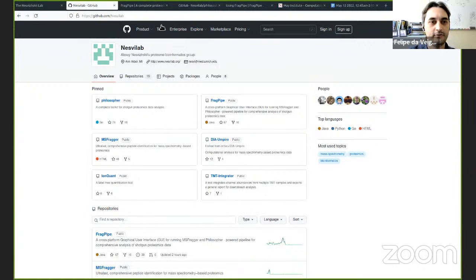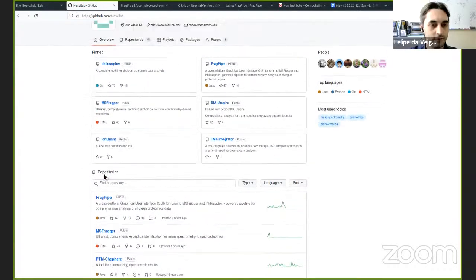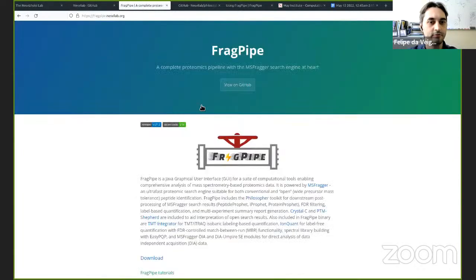So we have this GitHub page here. All the public projects are available here, so you can grab them all on the GitHub, with the exception of Fragger, and I'm going to show you how to get Fragger. I'm going to show you more specifically about FragPipe.